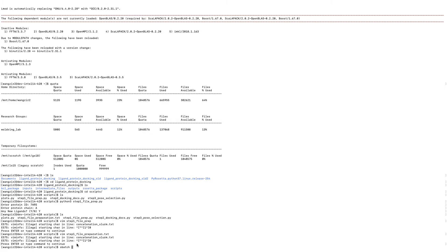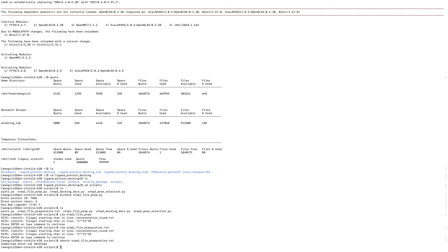So, to run the job, we give, we say, sbatch. And then we type the job name. So, it's sbatch. And step 1, file preparation dot text.